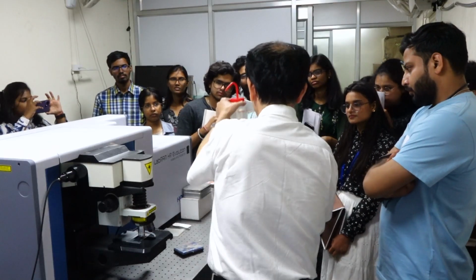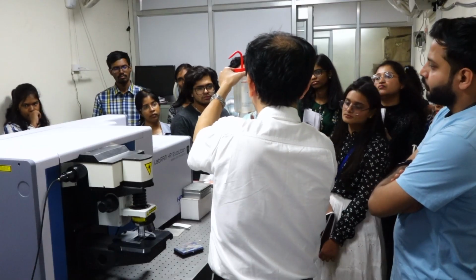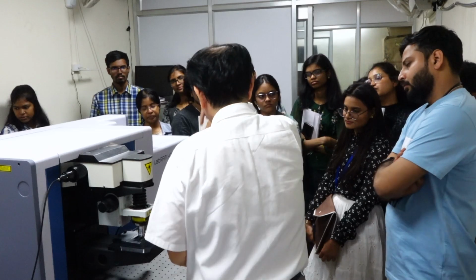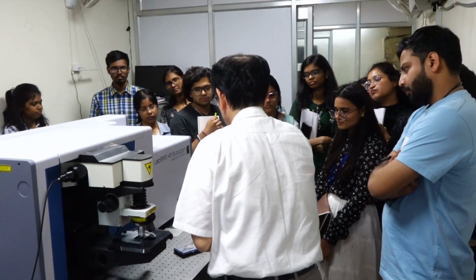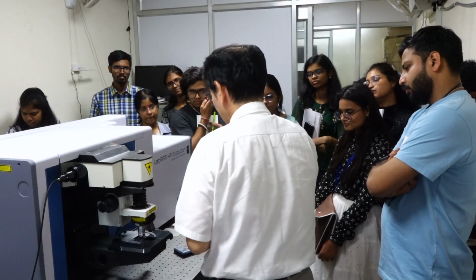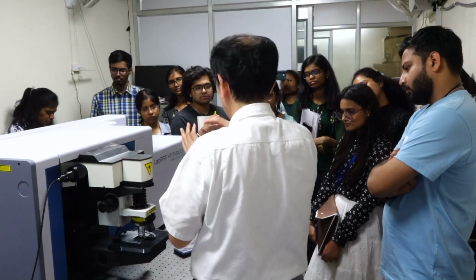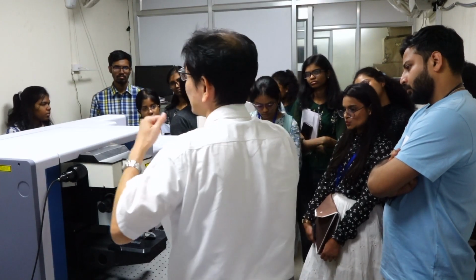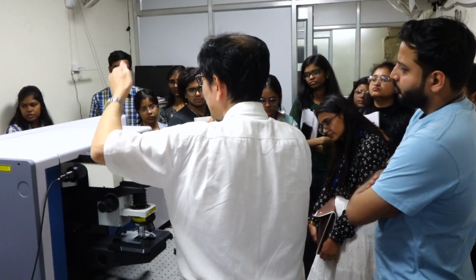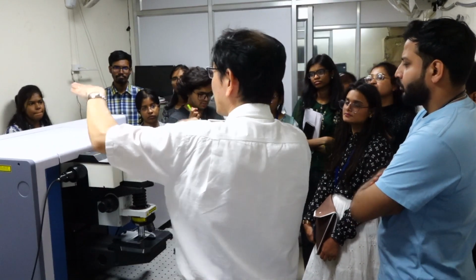in the case of 90-degree scattering, it's a little bit easier to separate the laser line and the Raman line. But in this configuration, the excitation beam is reflected by the surface. So the strong Rayleigh line comes with the Raman line, and we need to cut the Rayleigh line. One optical element to separate the Rayleigh line and the Raman line is the dichroic mirror, a two-color mirror. Okay?